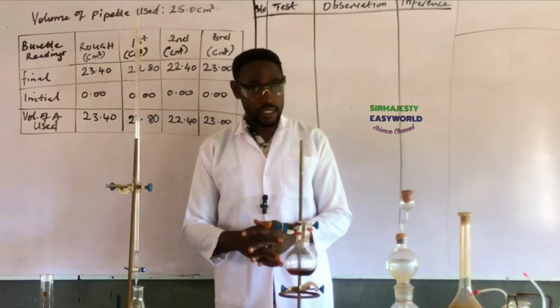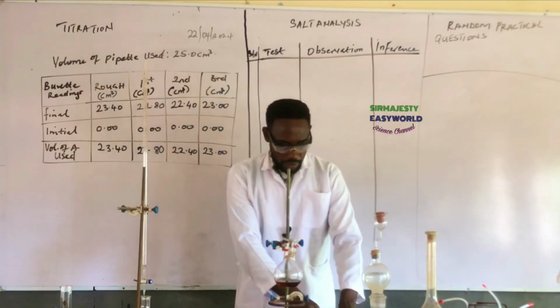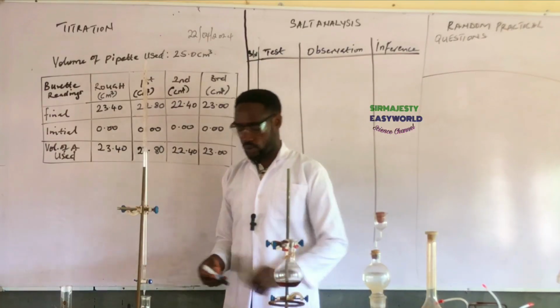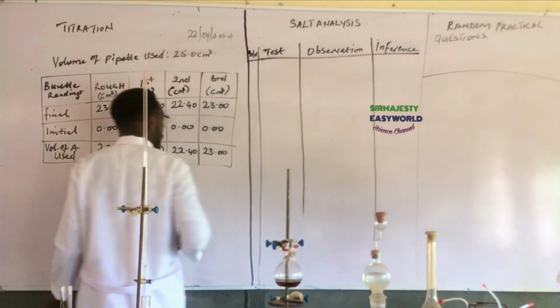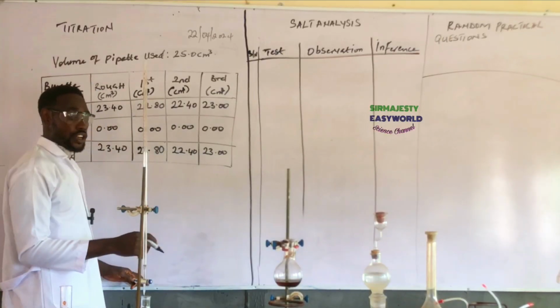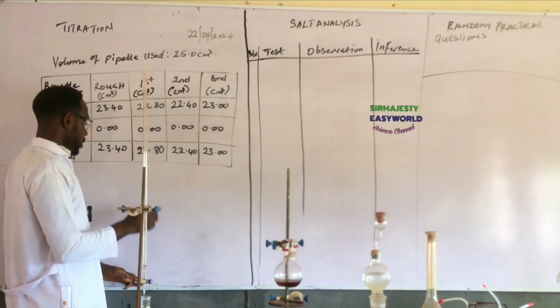How do we manipulate our table when we have gotten the endpoint from our teacher? So watch me now. Maybe that's why I say you have to communicate with your chemistry teacher. If your chemistry teacher says the endpoint, it is your chemistry teacher's figures that will be used to judge you. Very simple.